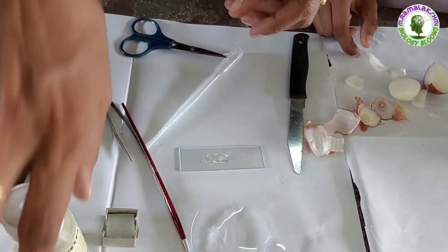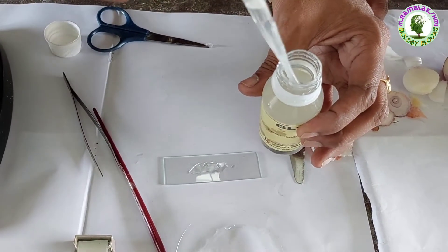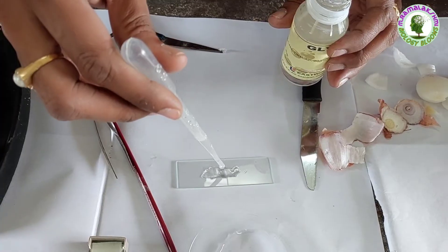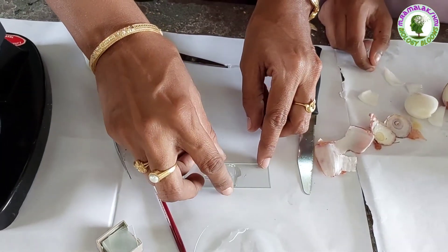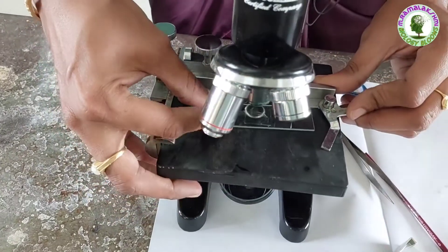Now put a drop of glycerin on it. Here we are using glycerin to keep the specimen moist. Now cover it with a cover slip without having any air bubbles. Place the slide under the microscope and observe it.